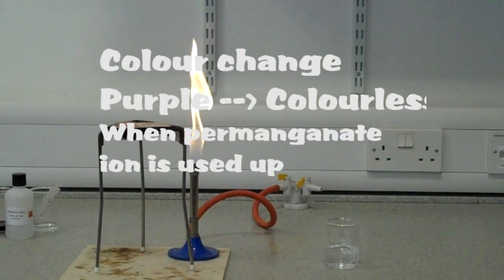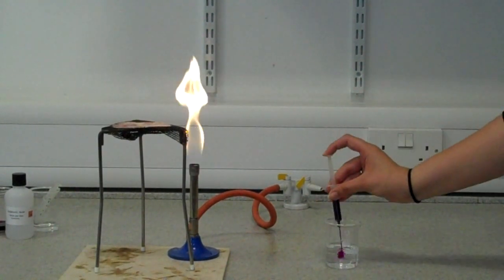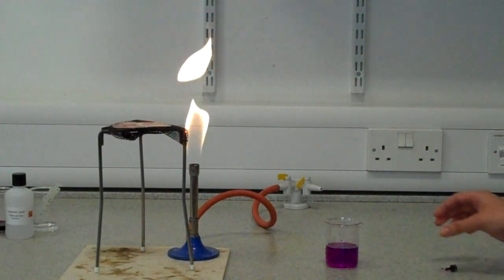In the beaker we have 5cm³ of sulfuric acid and 40cm³ of water. We now add 2cm³ of potassium permanganate and heat the solution to 40 degrees.